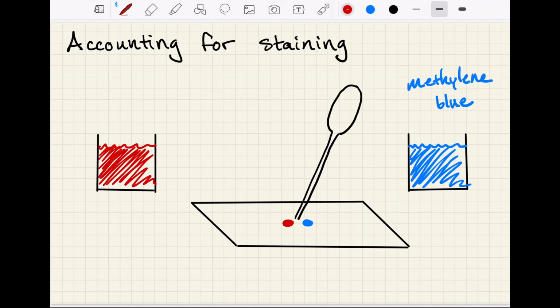You have the same number of cells in twice the total volume of liquid that you did in your original sample. This means that under the microscope, you're seeing half as many cells in the same amount of volume. So whatever cell count you get for the diluted sample, you have to double it in order to reflect the count in your original sample. I actually recommend doing your counts unstained because the methylene blue is toxic to the yeast cells. So it's a bit time sensitive, as over time more will die and turn blue. So you can do your counts without stain and without worrying about the dilution factor, and then afterwards you can go back and do staining to estimate what percentage of the cells are viable.